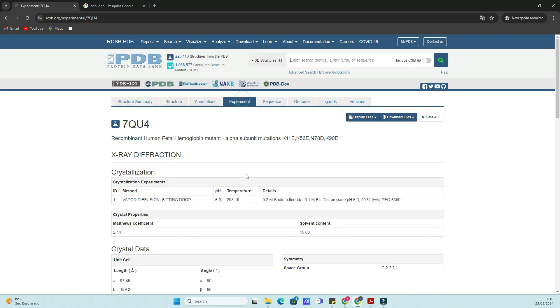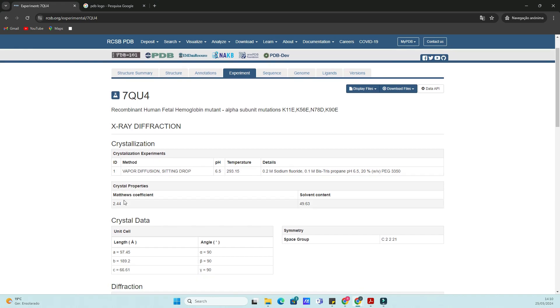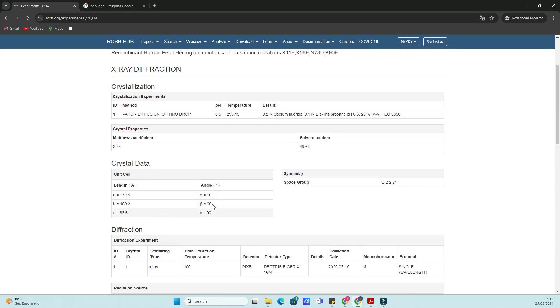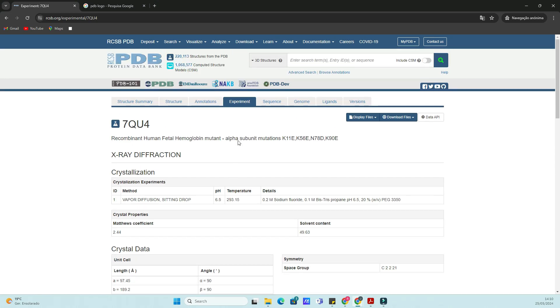You can also explore the different tabs such as Annotations, Genome, Sequence, and Ligands to have a better understanding of the protein of interest.